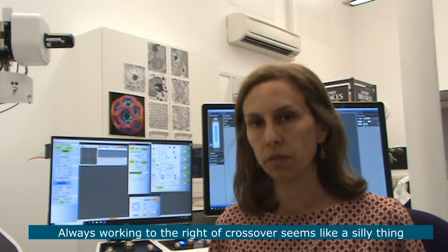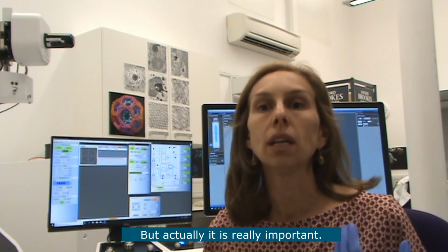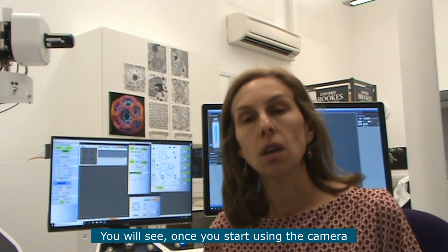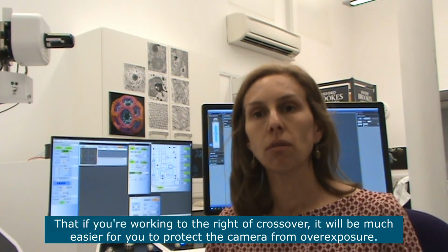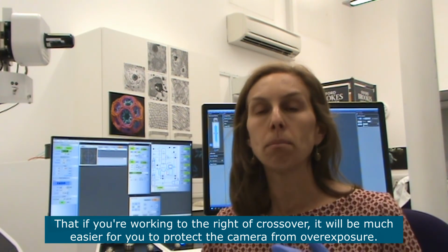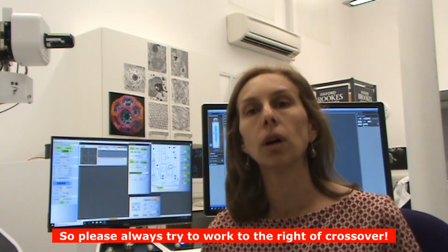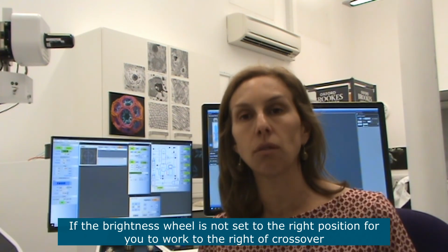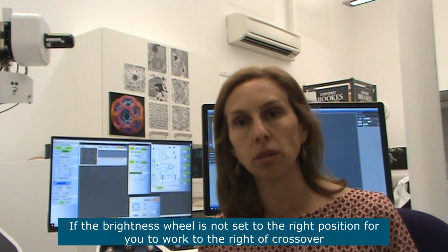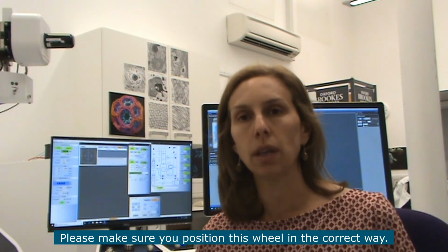Always working to the right of crossover seems like a silly thing, but actually it's really important. You will see once you start using the camera that if you're working to the right of crossover, it will be much easier for you to protect the camera from overexposure. So please always try to work to the right of crossover. If the brightness wheel is not set in the right position for you to work to the right of crossover, please make sure you position this wheel in the correct way.